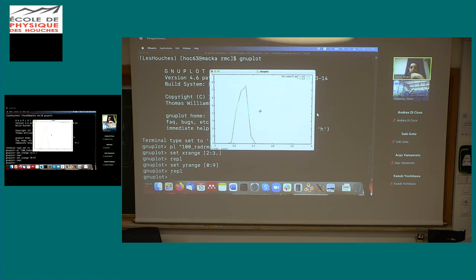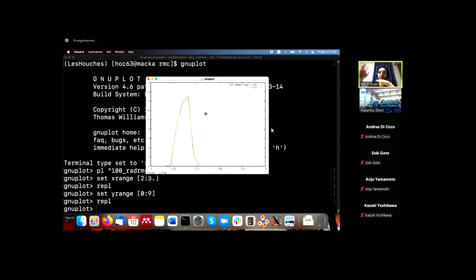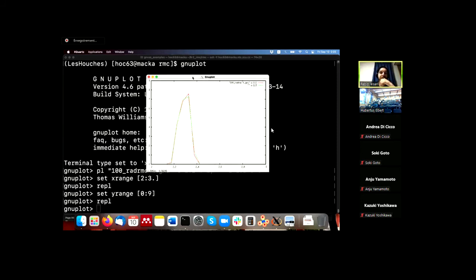Maybe it's difficult to see here, but usually the average serves to smooth out the pair distribution function, because one configuration is not sufficient to have enough statistics for a smooth radial distribution function, and you could have some noise-like features.